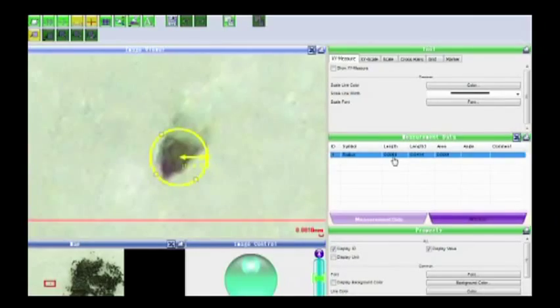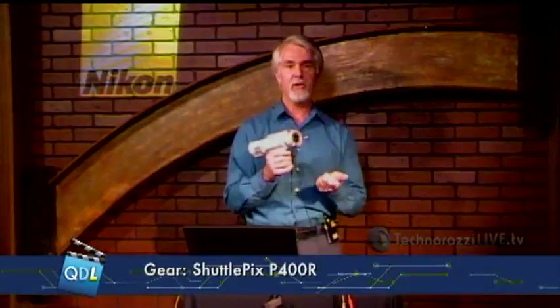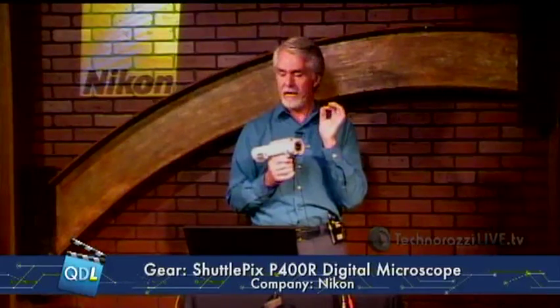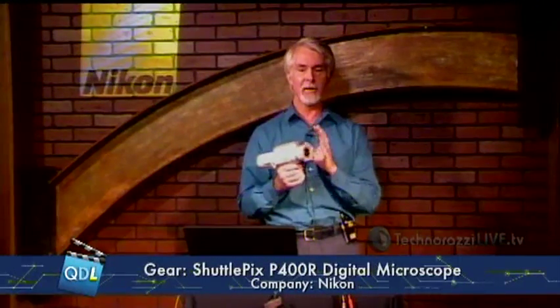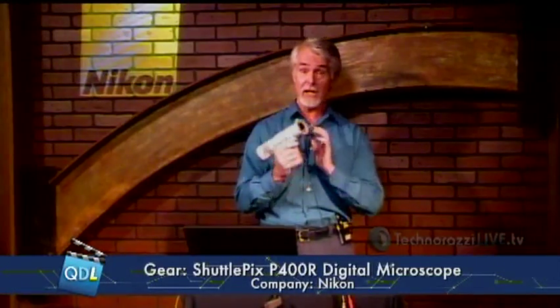The remarkable thing about this is that image was captured handheld. I zoomed up to 20x, had a field of view of maybe a millimeter, and I'm resolving a 14-micron particle — handheld. If you've ever tried to do that with a portable handheld microscope, you know that's almost impossible. And yet you can do it with this camera.